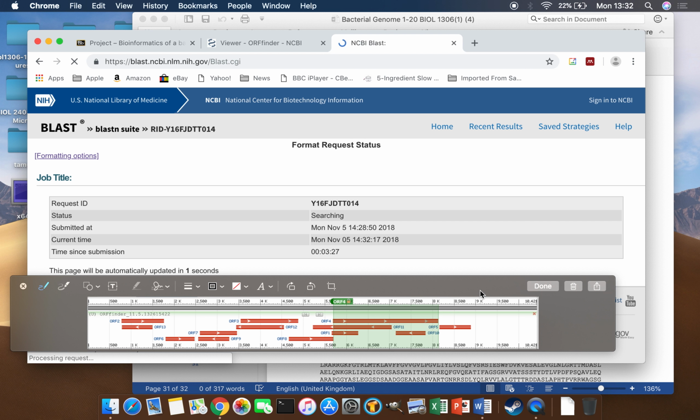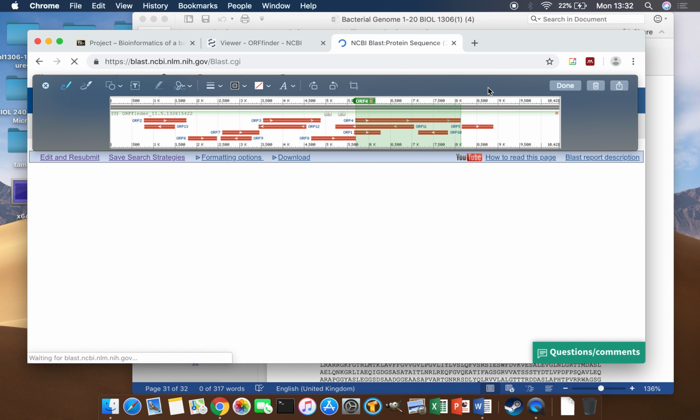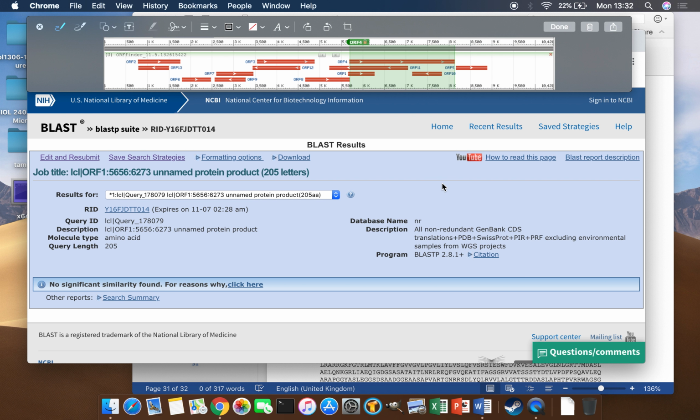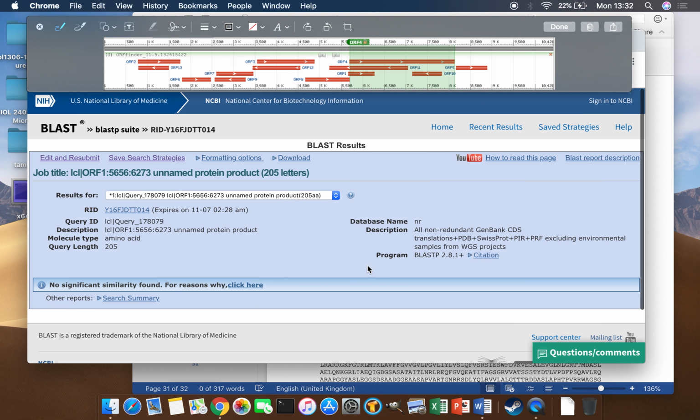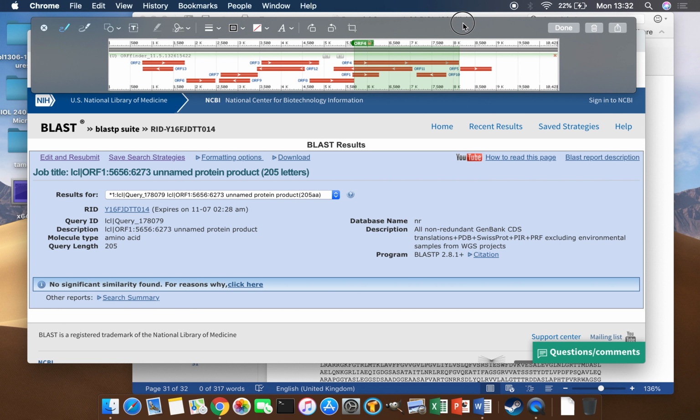So for right now, we've got our little map, which is great, and we've started the process of working on the other sections. So, oh, there we go. Now we've got the sequence up, or rather the results up here, and this is great. So I'll make the next section where we show you what to do with this, and another section showing you what to do with the map section up here. But for now, we are good, and so on to the next part.